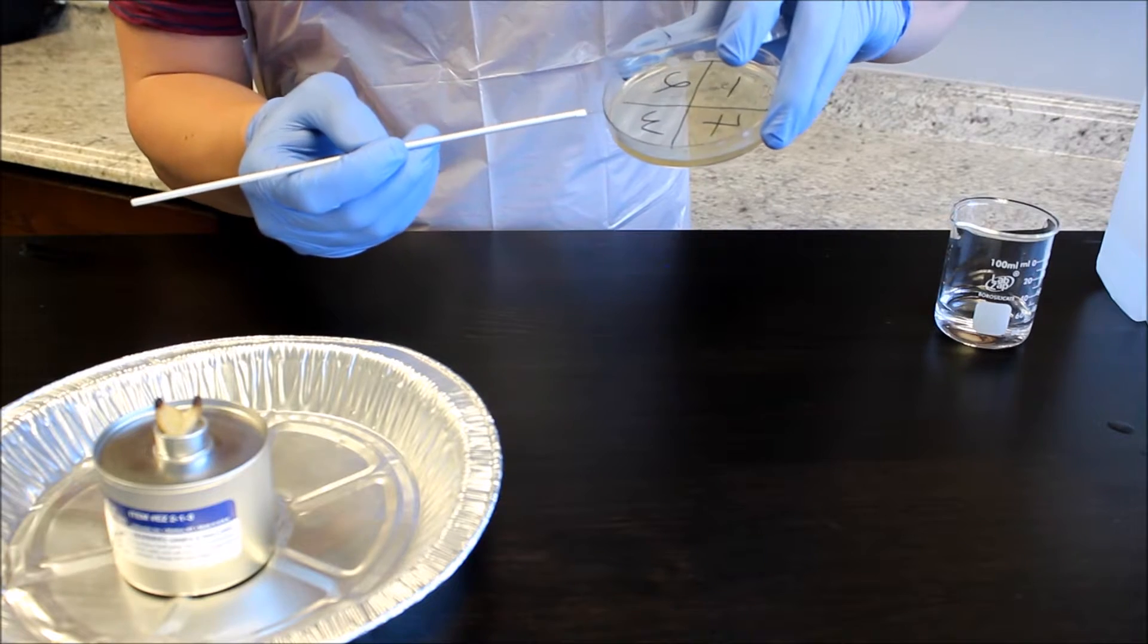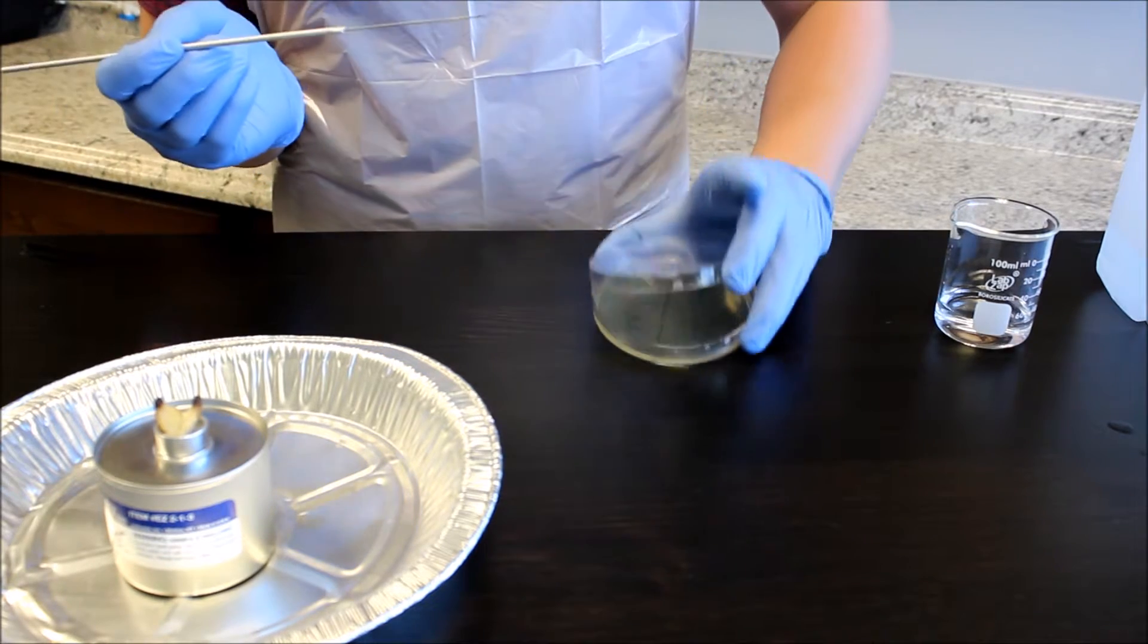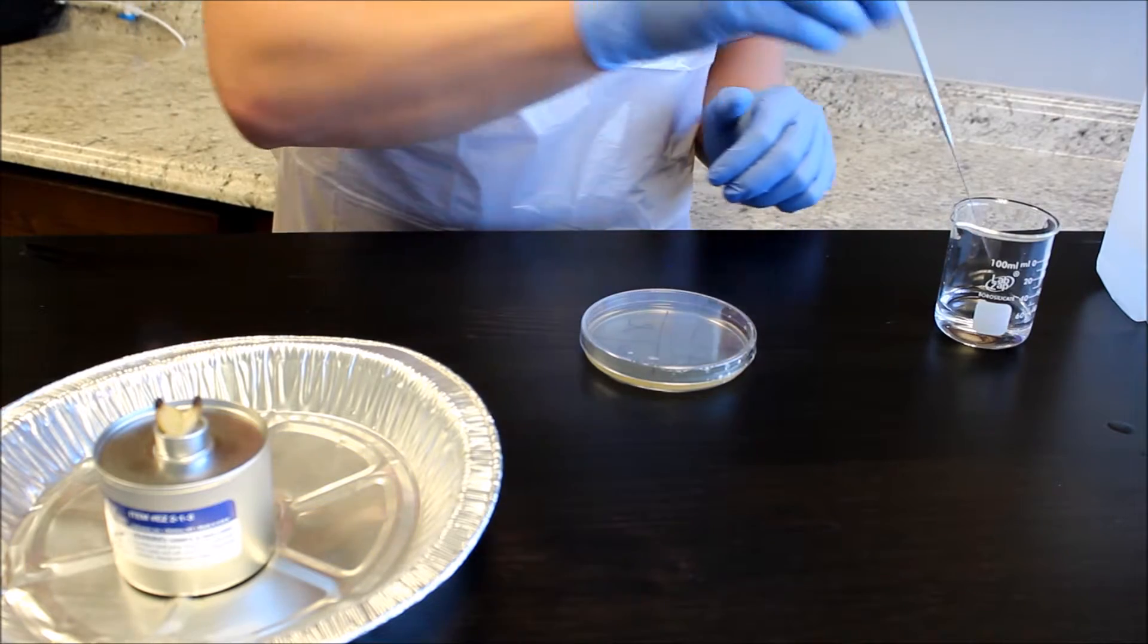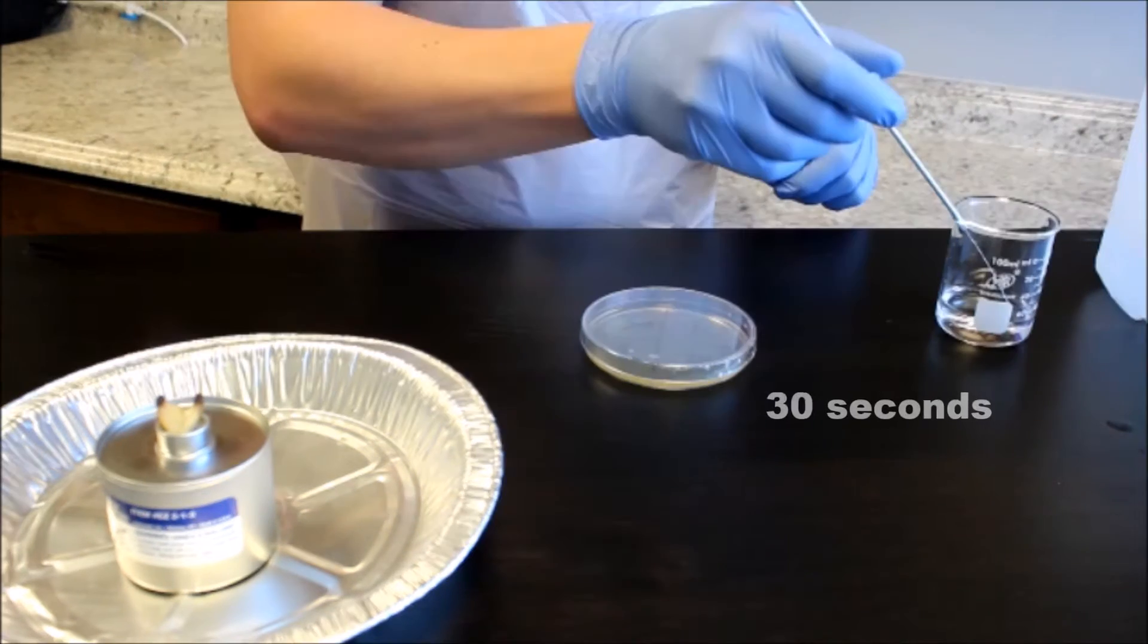Insert the loop and streak the first quadrant. Remove the loop, close the lid, and return the loop to the beaker of alcohol for 30 seconds.